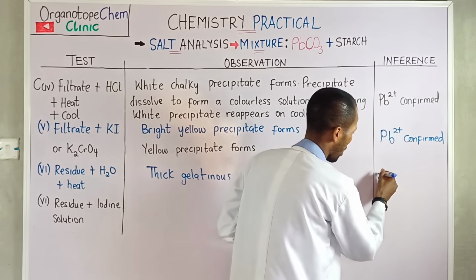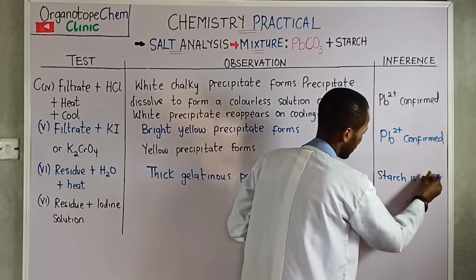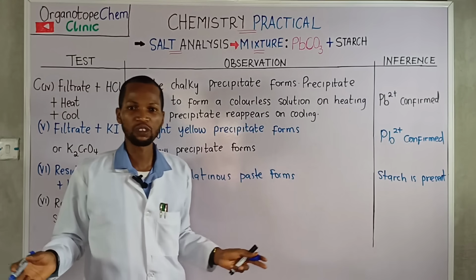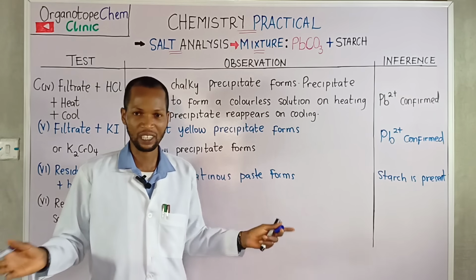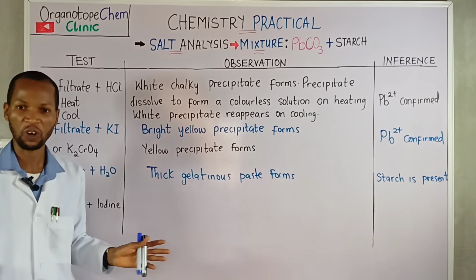So we can have our inference as starch is present. Okay, that reveals the presence of starch. So I call this test hot water test for starch.